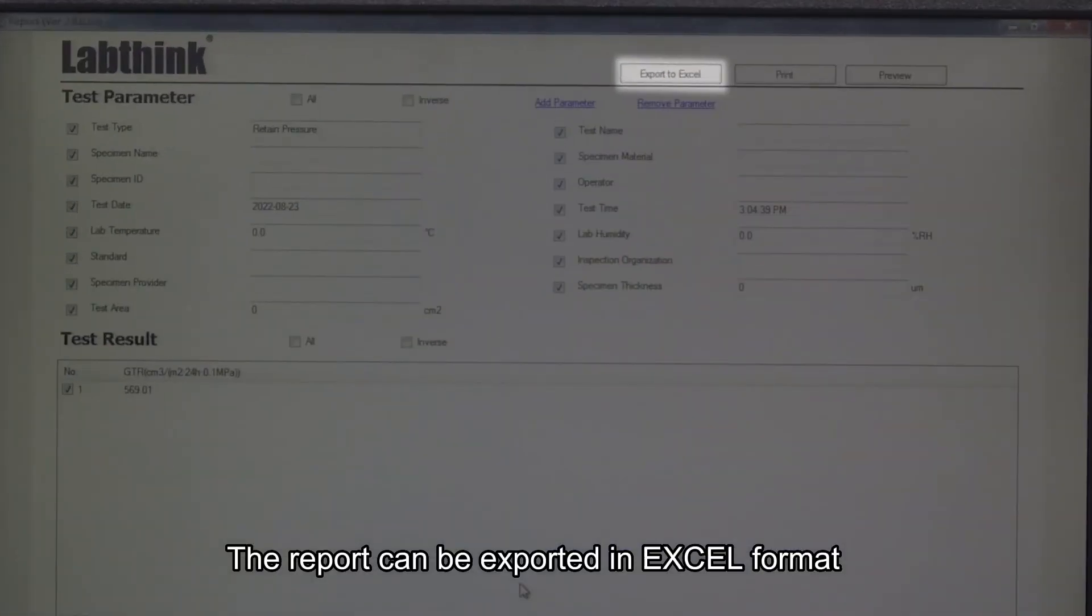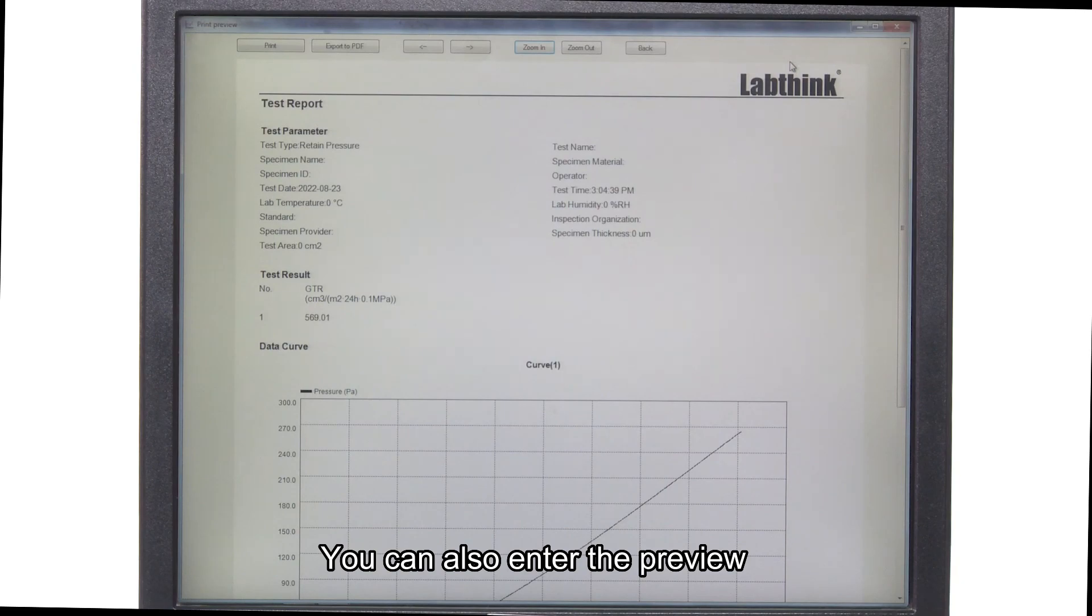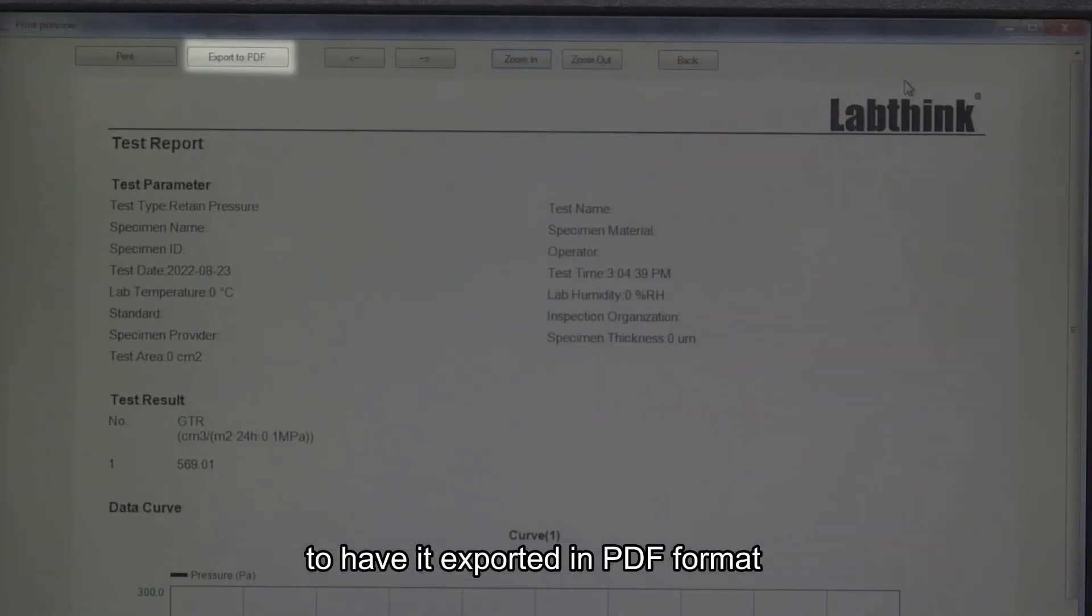The report can be exported in Excel format. You can also enter the preview to have it exported in PDF format.